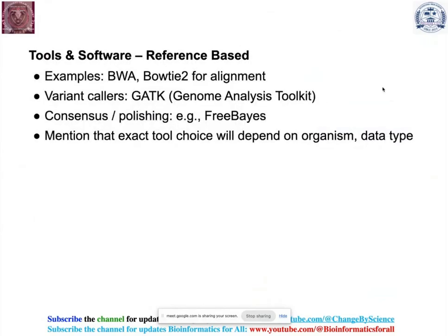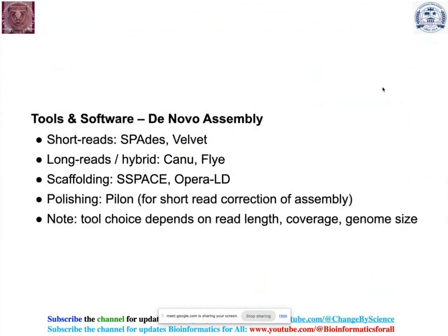Then the tools and software for both de novo and reference-based genome assembly. Of course, these are some of them, but when I will be presenting the separate case studies or a real application of reference-based genome assembly and analysis, then I will be discussing both of them.